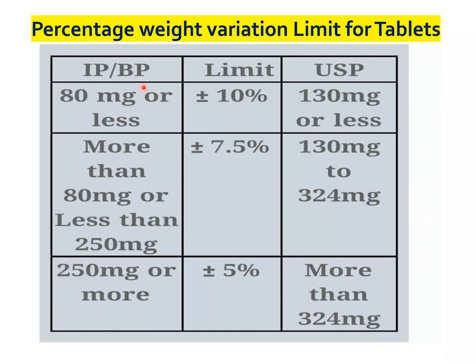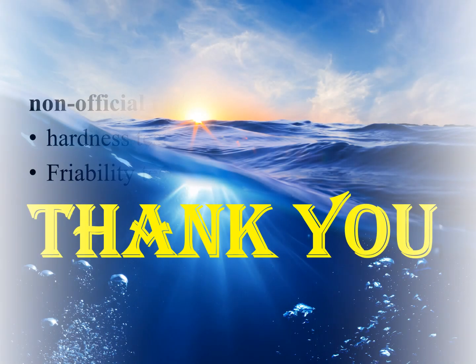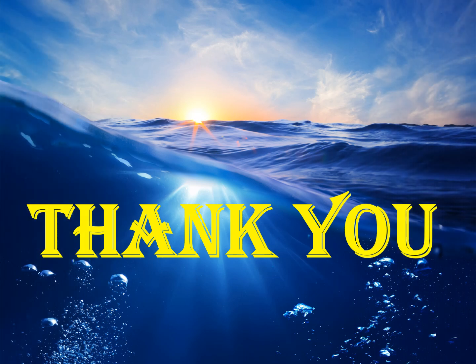So this is the USP and BP limit for percent weight variation of tablet. However, there are some non-official tests for tablet evaluation: hardness test and friability test. So that is all about the tablet manufacturing process. In our next lecture, we'll learn about tableting problems. Thank you.